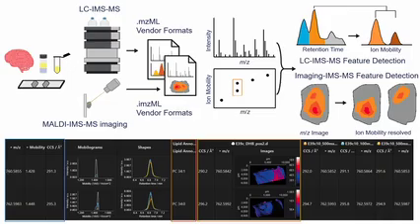So we have the extracted images, that's from the imaging data. On the right side, you can see the values from the chromatography, where we have the mass, the retention time and the mobility. And the fact that you have all this information together means that now you can annotate your compounds based on, for example, the MS spectra and the data that you have from the chromatography, and you can assign the identities.